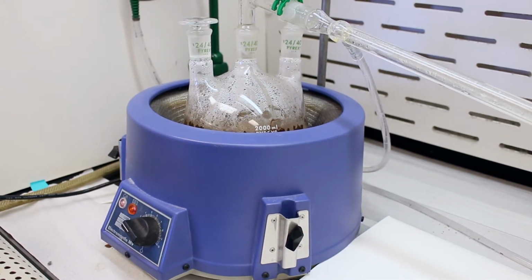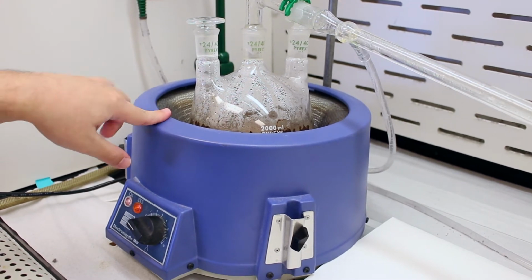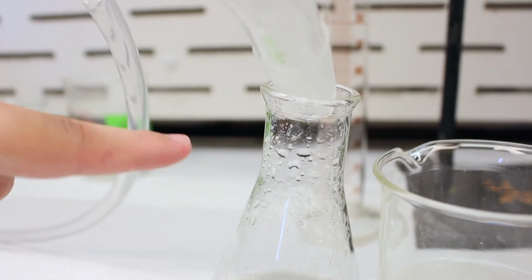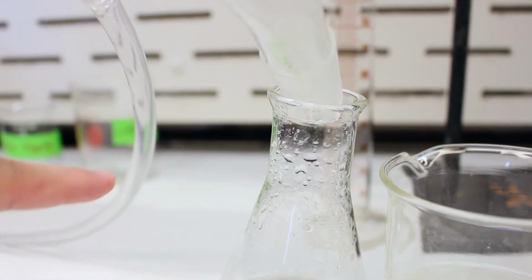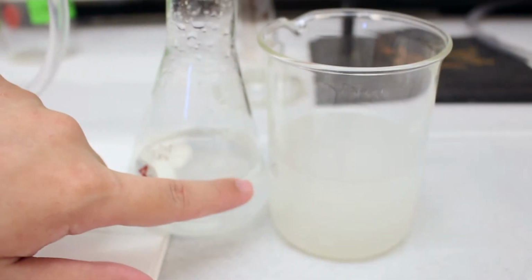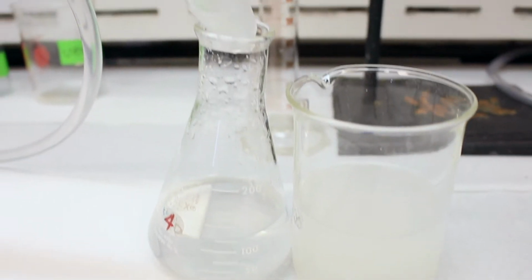So we've been distilling for perhaps an hour and a half here, and you can see the water level has dropped substantially, but we know the distillation is pretty much complete, because if you look at the distillate dripping here, you can see that it's no longer milky, which tells us that there's no more eugenol coming over. It's mostly just water. So the original fraction here is very milky. It contains a lot of eugenol in it, but what we're collecting now has very little. So we can stop the distillation and move on to the next step.